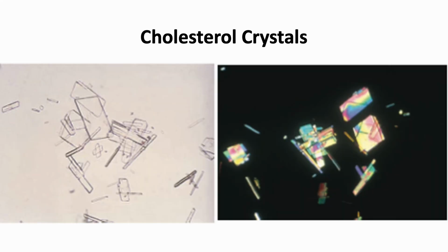Cholesterol crystals are rarely seen unless the specimens have been refrigerated. Since lipids tend to remain in droplet forms, the cholesterol crystals tend to be very rare. The most characteristic appearance of the cholesterol crystals is rectangular plates somewhat notched in one or more corners, and they are associated with disorders producing lipiduria, such as nephrotic syndrome. They are seen often in association with fatty casts and oval fat bodies. Cholesterol crystals are highly birefringent under polarized light.